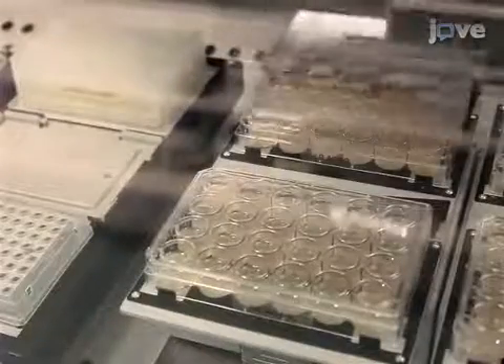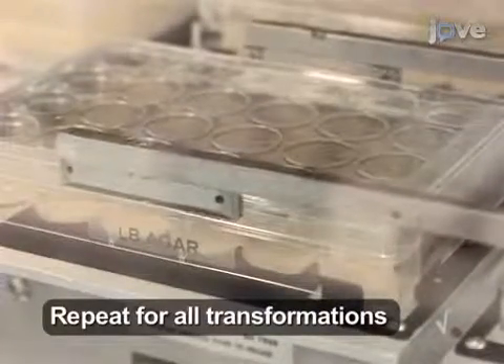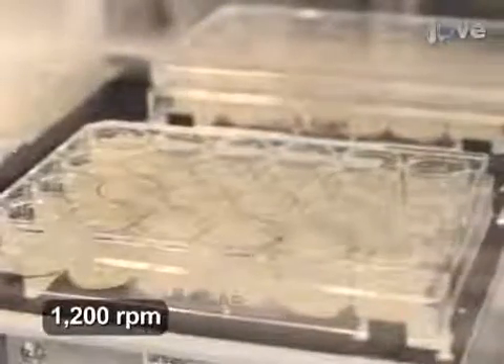Once the transfer to the first plate has been completed, replace the lid and begin the transfer for the next plate. Once all of the transformations have been plated, shake all of the plates for one minute at 1200 RPM to generate a homogenous distribution of the transformation mix.